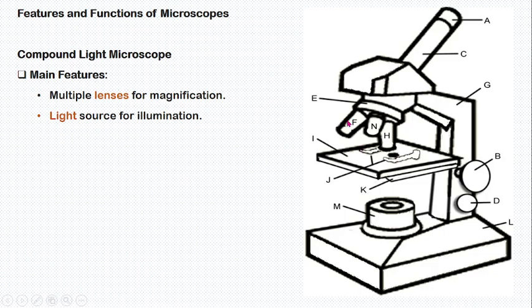You should understand that each microscopy has parts. As the human body also has parts, head, and so on, microscopy also has head, maybe abdomen, also legs, but the parts are not the same. You should come here and memorize each part of microscopy. And after this video, I'm telling you surely that you're going to be able to explain this right microscopy. So this is compound microscopy. It is not electronic. This one is light microscopy.